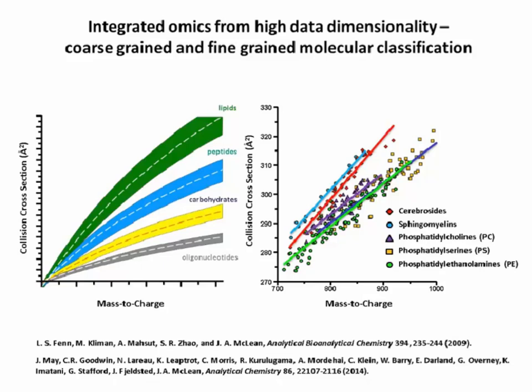Now, this is tremendously advantageous for natural product discovery because oftentimes natural products that we seek typically have scaffolds that are very different from typical biological molecules. So if we can rapidly map where they occur in this collision cross-section mass-to-charge space, we can prioritize which molecules have unique scaffold structures combined with their biological activity in the drug discovery pipeline.